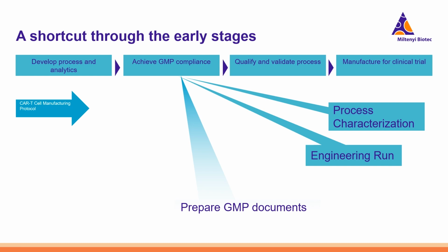The protocol is based on SOPs from our side, so it's fairly easy to translate into SOPs. And as I already said, during the training, there will also be batch record templates and document templates that will be used, which should assist with these initial parts of achieving GMP compliance.